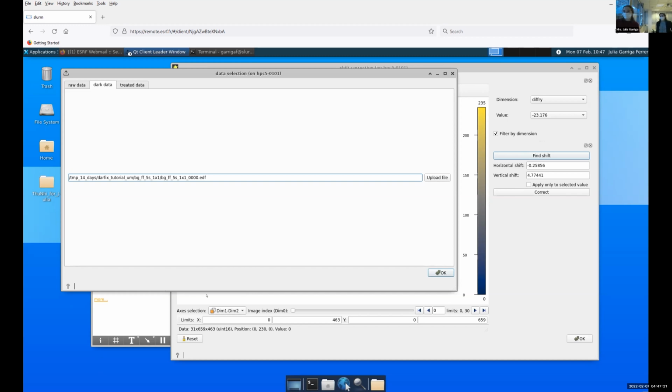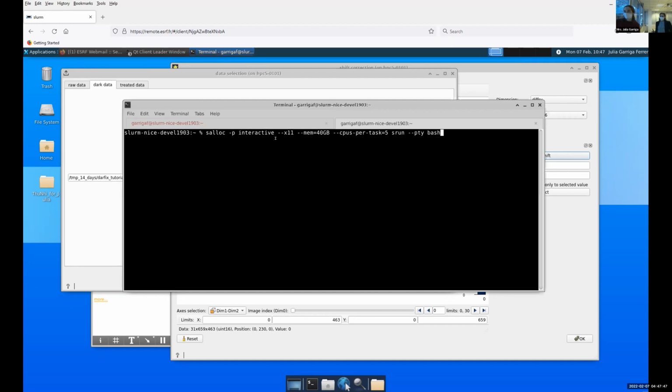So there's some. But the command does not work. Oh, can you copy paste it? Did you copy paste it from what I entered, or is it minus the X11? You cannot copy and paste? Ah, yeah, that's a problem. Just make sure, because maybe you left something in the command, because it should work. Look, could you allocate? Okay. The command salloc itself does not work. I'm gonna try it from mine. Okay.